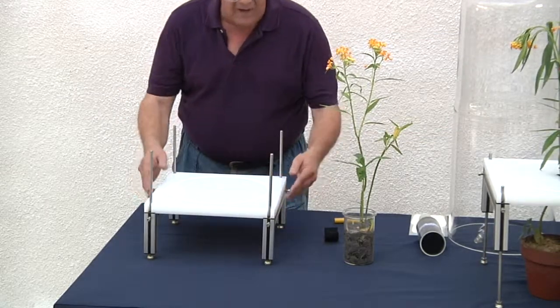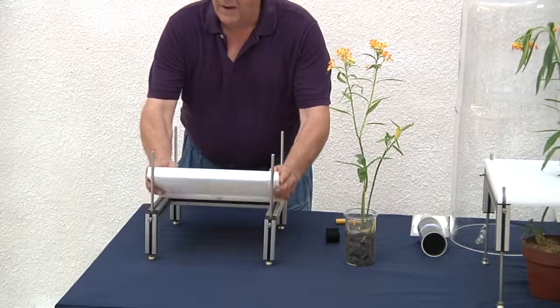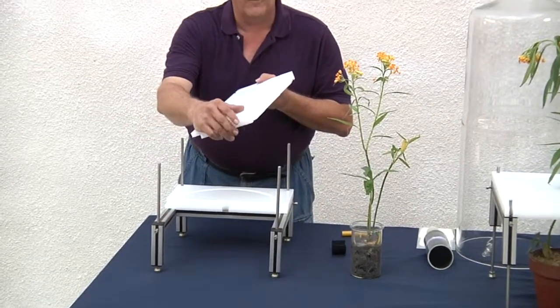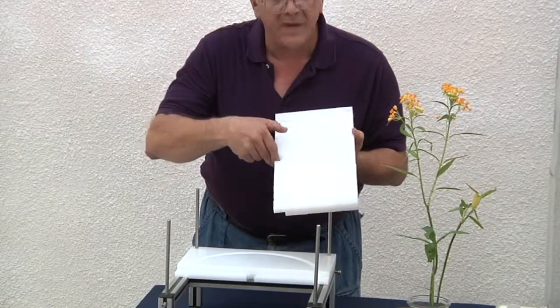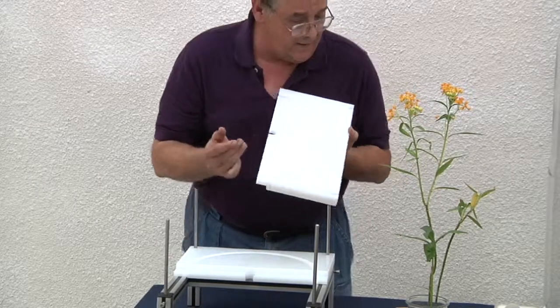The adjustable height stand pops up and you'll see the grooves that lock it into place. We also have the cutout for where the stem of the plant goes.